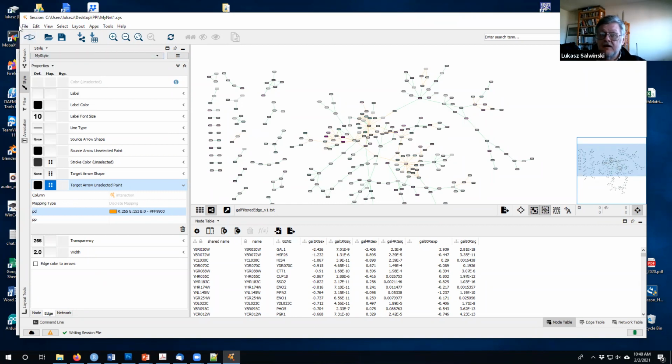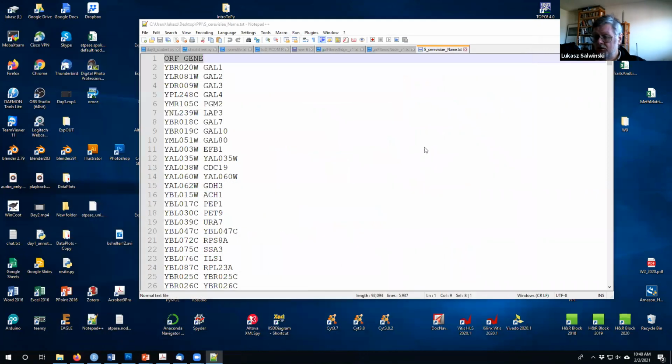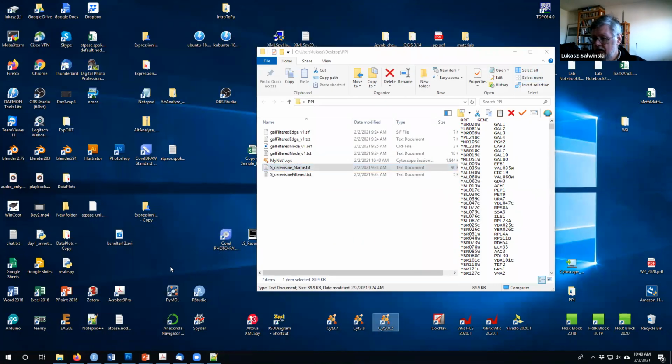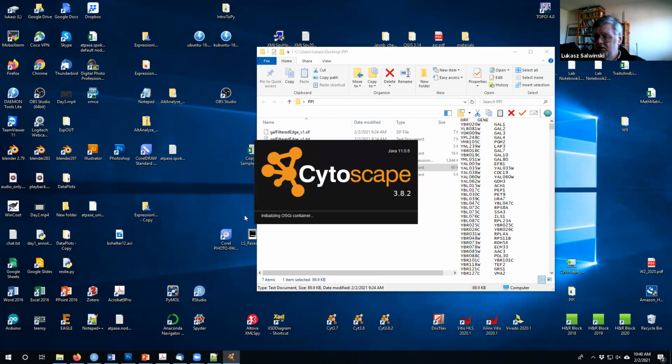Once it's saved, let's quit it for a moment. I'm just gonna shut down Cytoscape. Do you want to save? No, just quit. Okay, so now Cytoscape supposedly died, and now I can restart it. I can open it. It's going to open in a moment. Cytoscape is big, so the startup takes time.